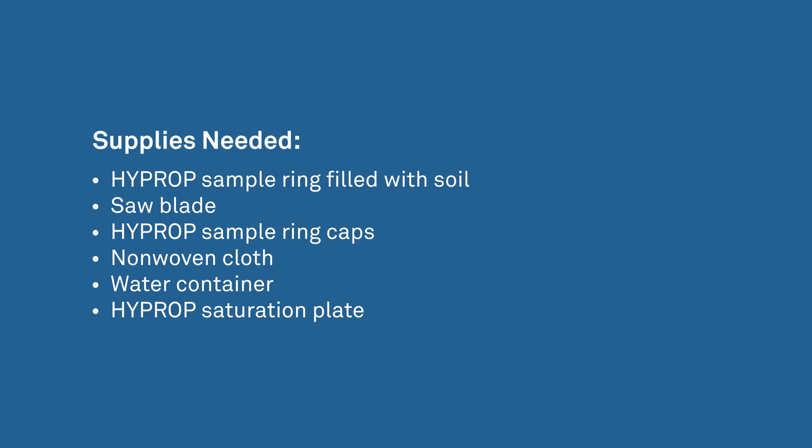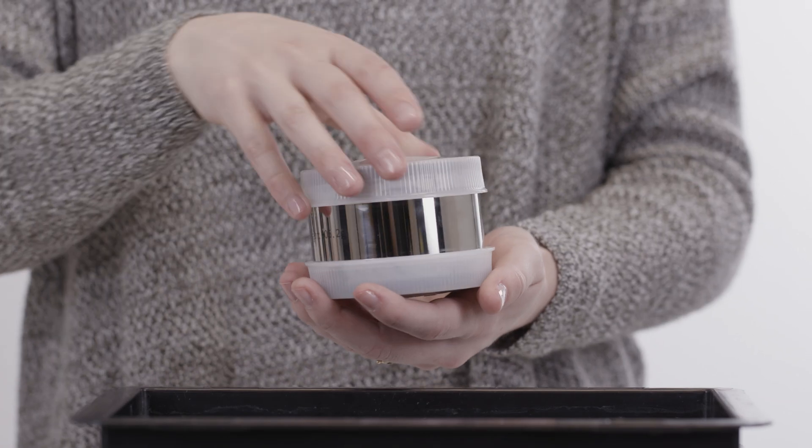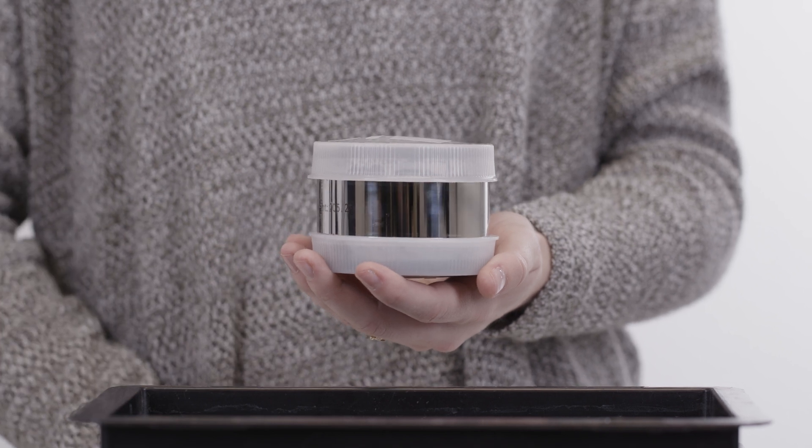To prepare a sample, you'll need the following supplies. Take the soil-filled sample ring out of the transport box and clean it.